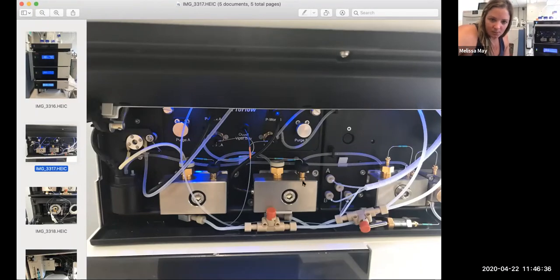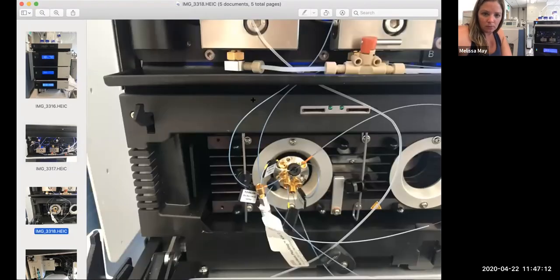this one right here is B, your pump block. Inlet is here. You can see this is the purge B. Here's purge A. Right here, it says outlet Viper only. And this outlet, it's kind of hard to see because it got cut off here, is the flow meter, okay? And so the flow meter is what's taking these two solvents, mixing them together at whatever rate or proportion they're supposed to be mixed at. And it's sending it out through this flow meter, through this tube, down into this 10 port block, right?